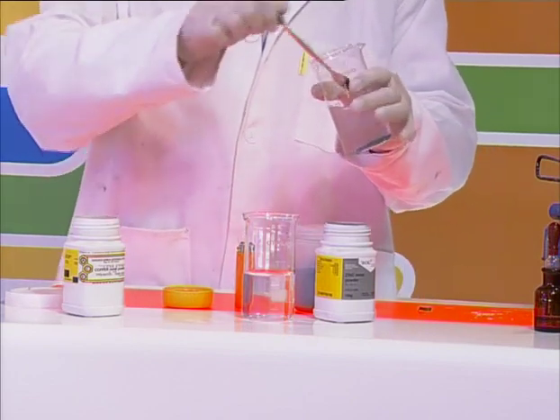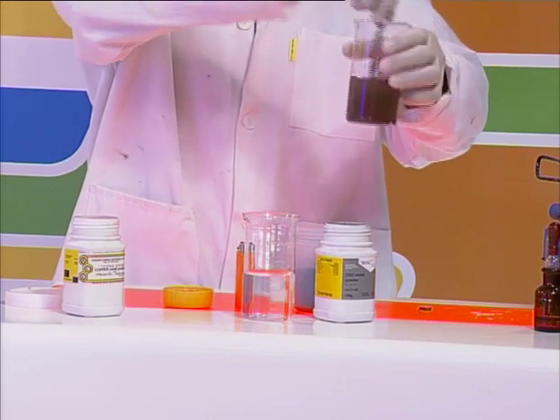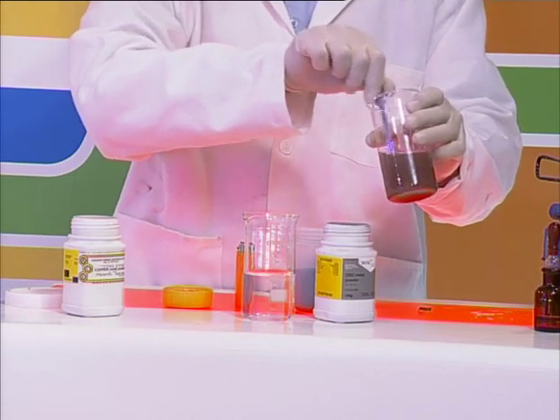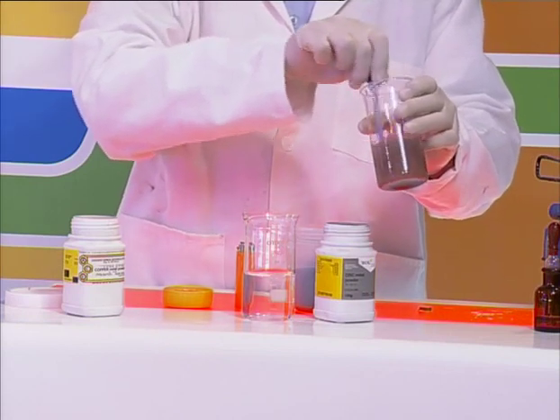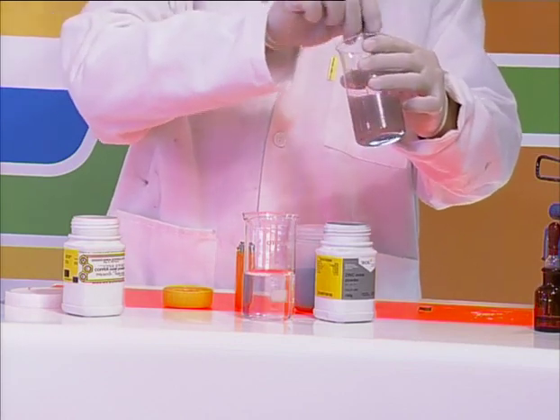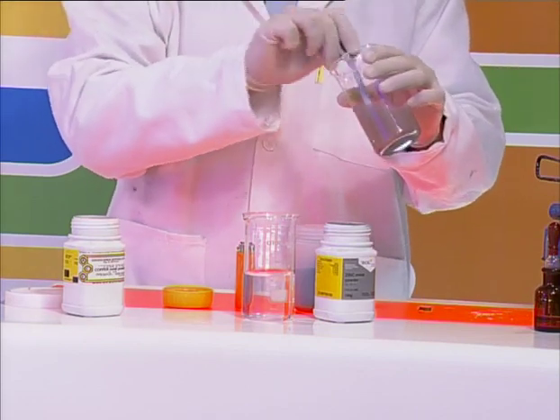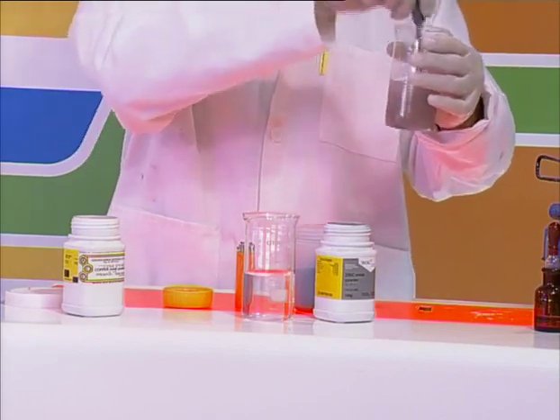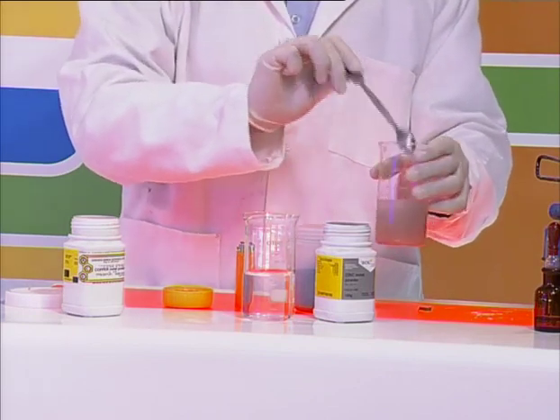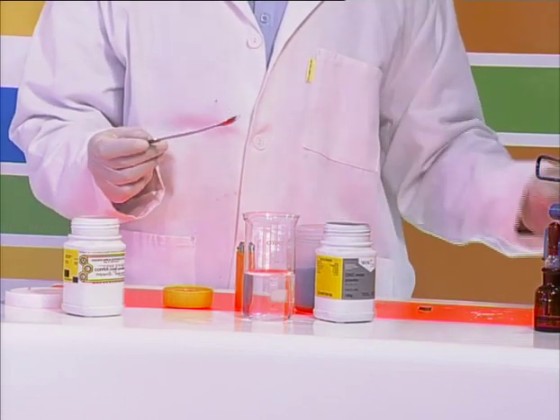And what you'll notice is that when I stir this copper powder in, this brown powder over here, nothing really all that exciting is actually happening. I noticed that when I put copper inside zinc sulfate, very little happening, and I actually noticed that the brown powder stays brown, and that's not very cool. Okay, so I like chemical reactions, there's very little happening, and I'm actually going to prepare the second experiment, and we're going to see what happens. So brown powder stayed brown, nothing exciting. I'm going to put that down.